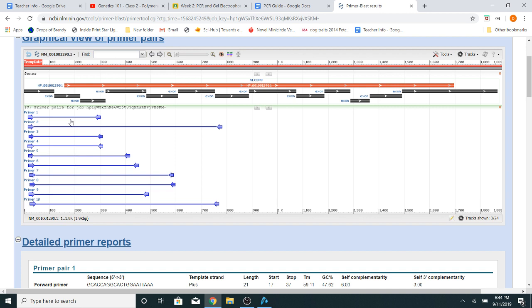And we could look at things like the cost of the primers or whatever, but honestly primers are fairly cheap, and even the calculated results don't really tell you a lot. They're sort of theoretical, and biology doesn't like to comply with theory, so it never hurts to have 2 or 3 options. So these primers will be slightly different. If we go down here, we can take a look.